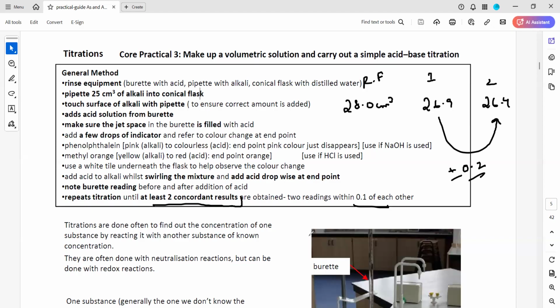No, the range finder depends on the different experiment. I'm just giving an example. Let's say for this experiment you have a range finder of 28, meaning 28 cm cube of volume you remove from the container the first time, and you observe a color change. So you will have an idea that when you reach around this value, like 28 or 25 or 26, you should add drop by drop.